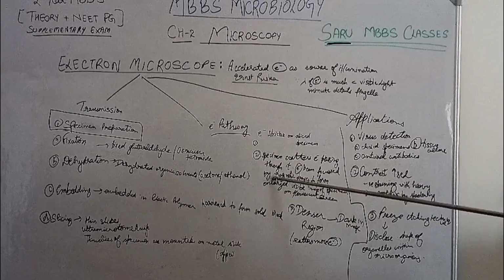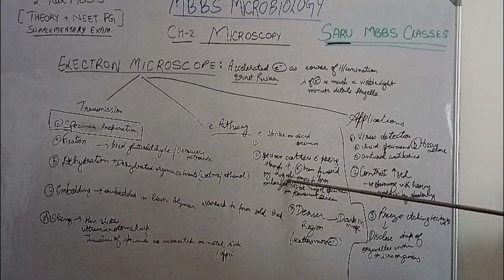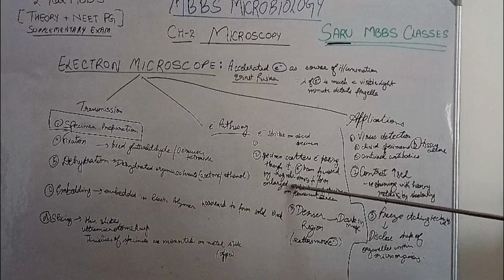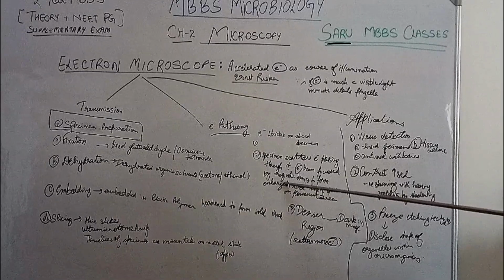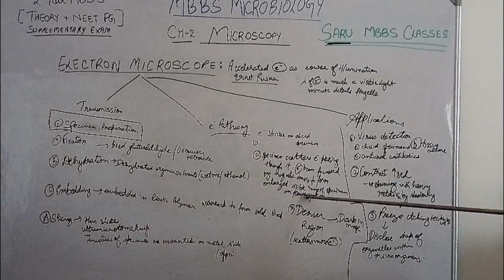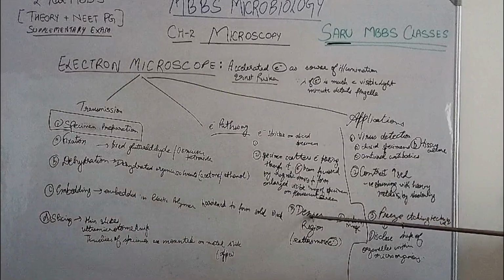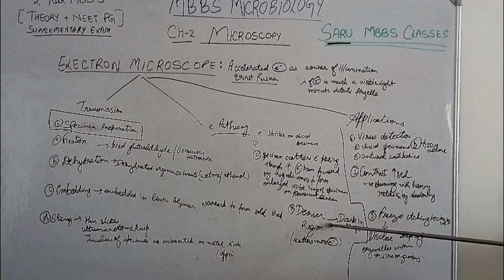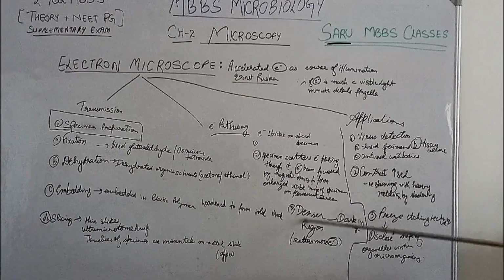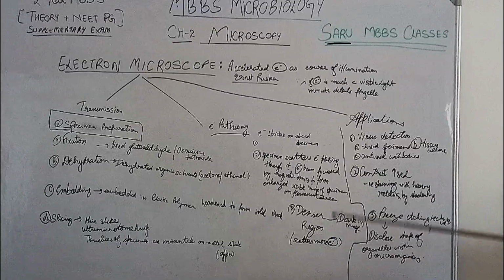The electron beam, which is passed by the magnetic condensers, is focused by the magnetic lenses to form an enlarged visible image of the specimen on the fluorescent screen. Wherever the region is denser, few electrons strike, so it appears dark in the image, as the denser region will scatter more electrons.